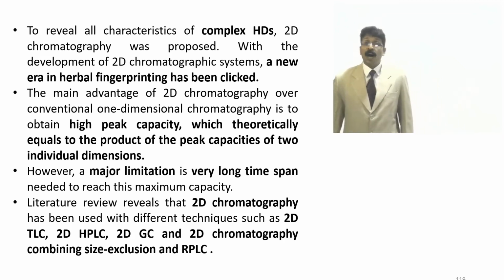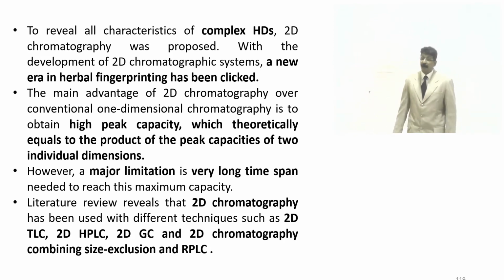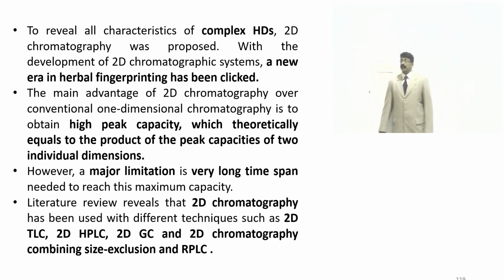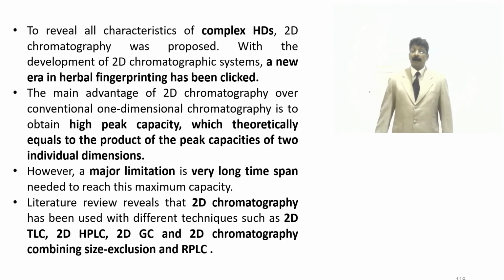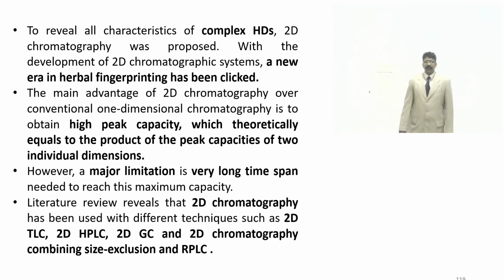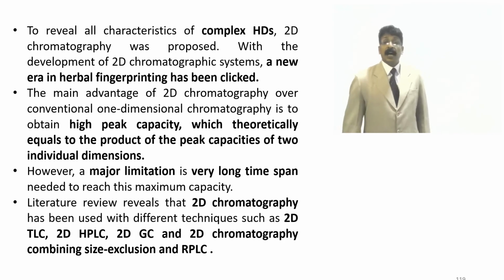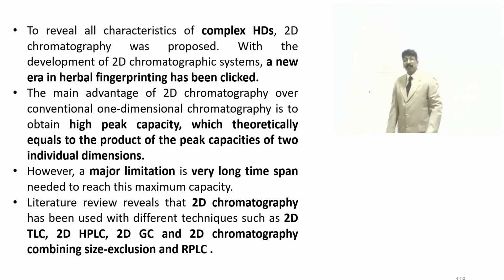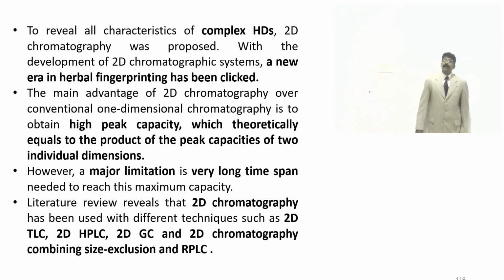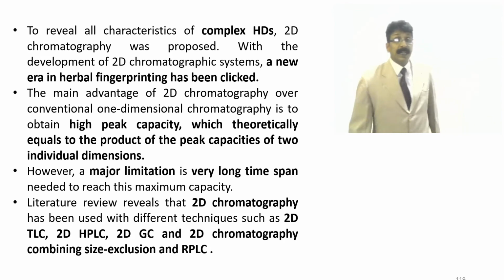If you are using 2 instrumental techniques, like chromatography combined with mass spectroscopy, or high performance liquid chromatography with IR spectroscopy, and liquid chromatography connected with even NMR, nuclear magnetic resonance instrumentation, then you can go for hyphenated detection. And you can say even 2-dimensional chromatography is also an example of hyphenated, because 2 different techniques are used, and that is possible.